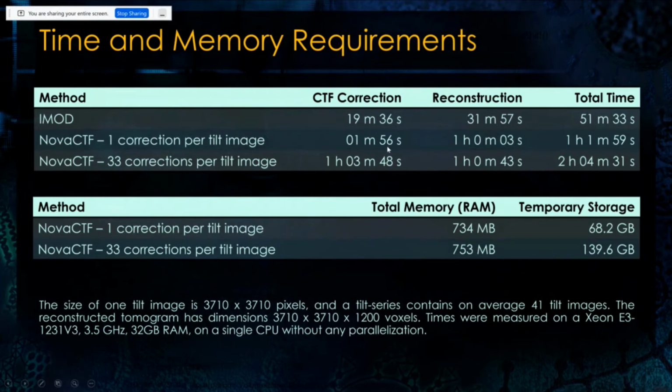Now this also can be parallelized. So what we now normally do is that we run all of these corrections at once on clusters, so that basically makes this 1 hour being rather 2 minutes, and time-wise we are very comparable to IMOD right now.